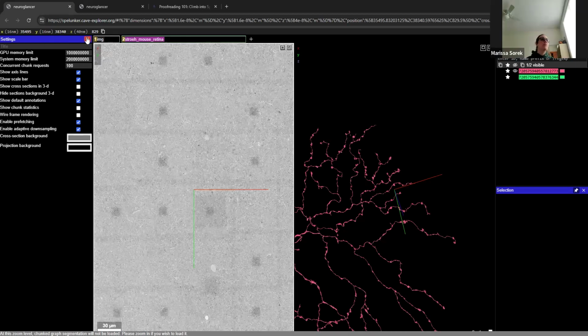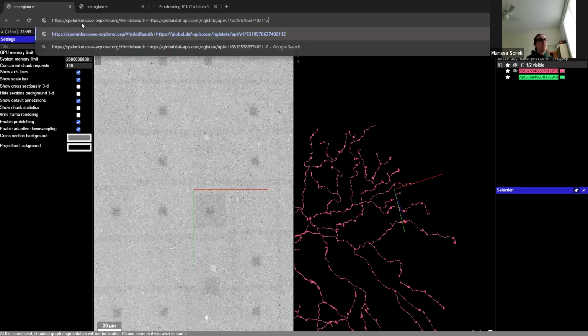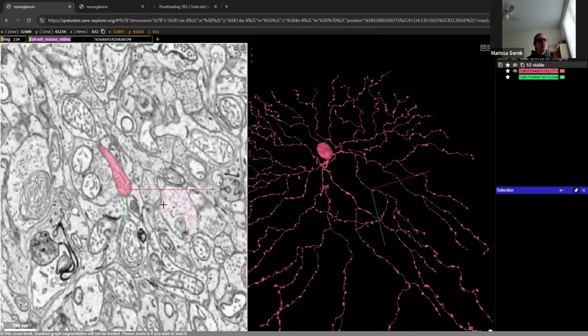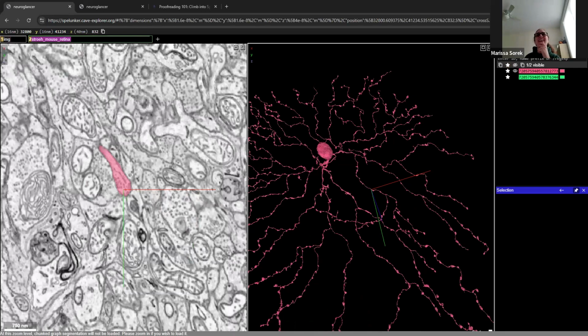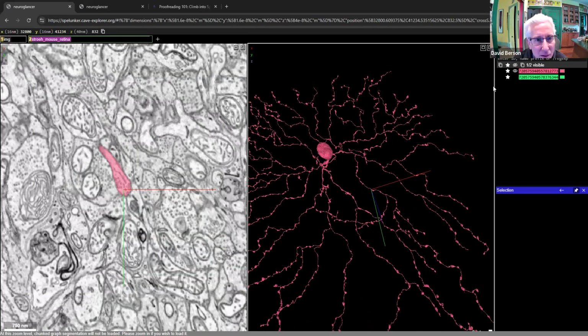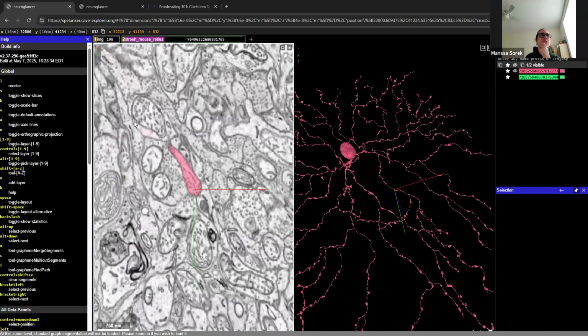Which I'll mention right now while we're talking about it. First things first, though, I'm just going to reset my screen real quick here because I zoomed out so much, sometimes it has trouble. And so we have this little screenshot camera here, so that'll take a little screenshot and you can set it up how you want it and take it. It's actually really nice, available for taking images there. We also have this help menu, which is next to our settings, which is the question mark.